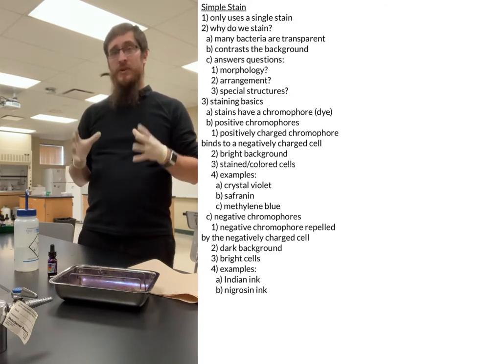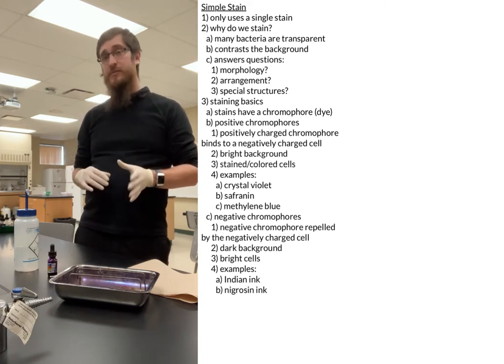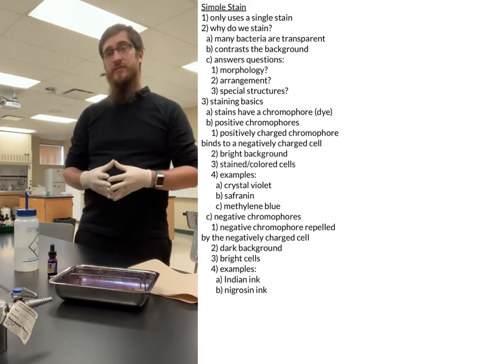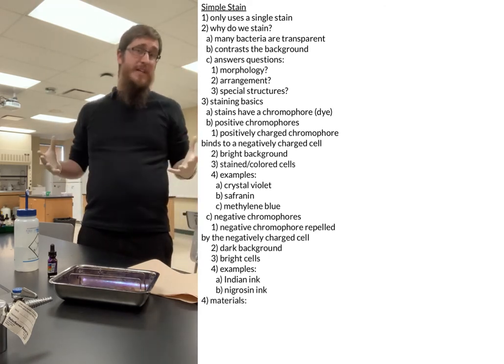For this video, we're not really going to worry about the negative stains because they're their own beast in itself, so we'll talk about that in a different video. But we're going to talk about the positive stains and how to do a positive stain in this video. With that in mind, let's talk about what we need to actually do the stain.